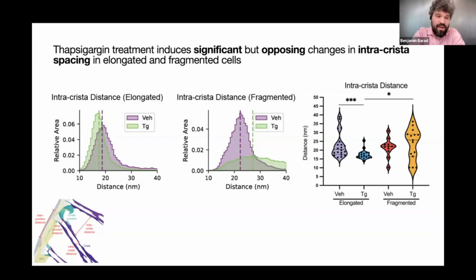We think in the fragmented ones, we're actually seeing the beginning of that cytochrome C release that I was describing, where you're losing the regulation of the cristae junction and the whole thing is coming open. If we watched these cells for 2 more hours instead of plunge freezing them, the fragmented population might have all died.